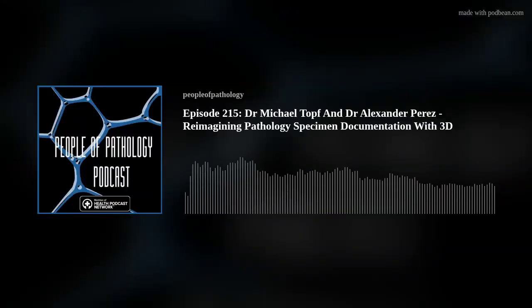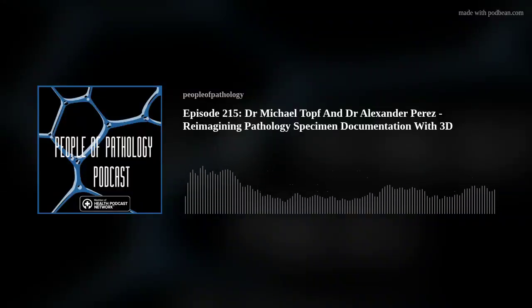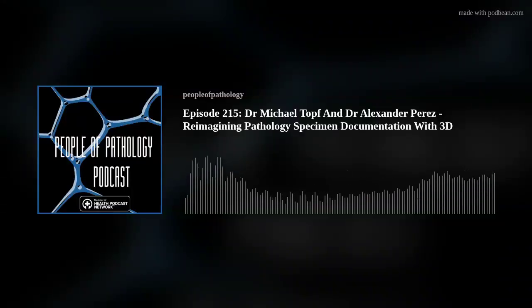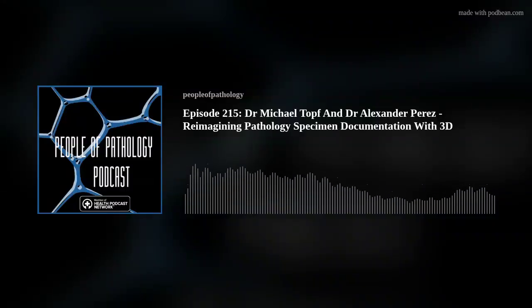So if people are hesitant, there's going to be a learning curve. There's just no two ways about it. We happen to have some people who were pretty technically adept, who had prior experience in 3D modeling and scanning before, so that helped us get on our feet, because like you'd imagine, having someone who knows what they're doing with it and can make a nice looking product gets people on board. So there's going to be a learning curve. It's going to be difficult in the beginning. You're probably going to think, well, I should have just taken a couple more gross photos.